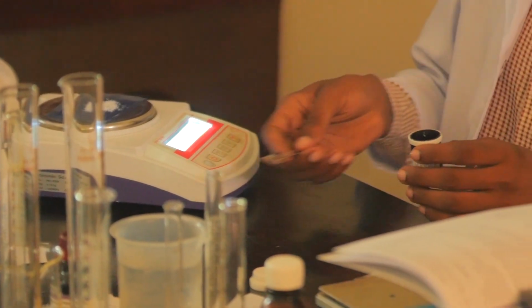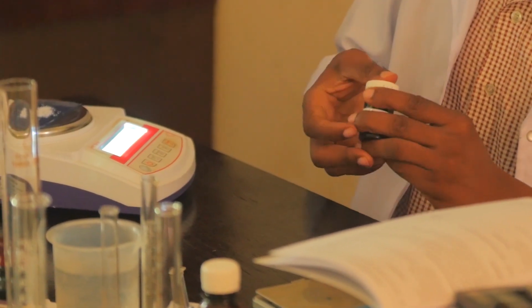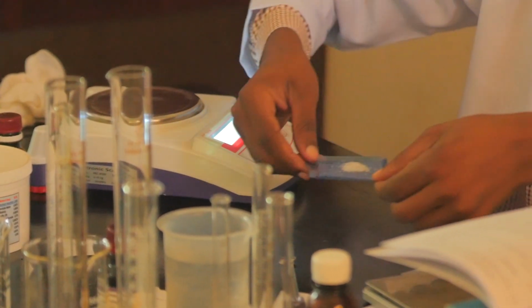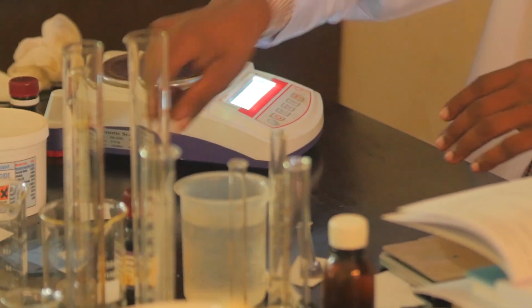Yes, there we are. That is 0.5. Exactly 0.5 grams of potassium iodide. Then you can label on your table potassium iodide.